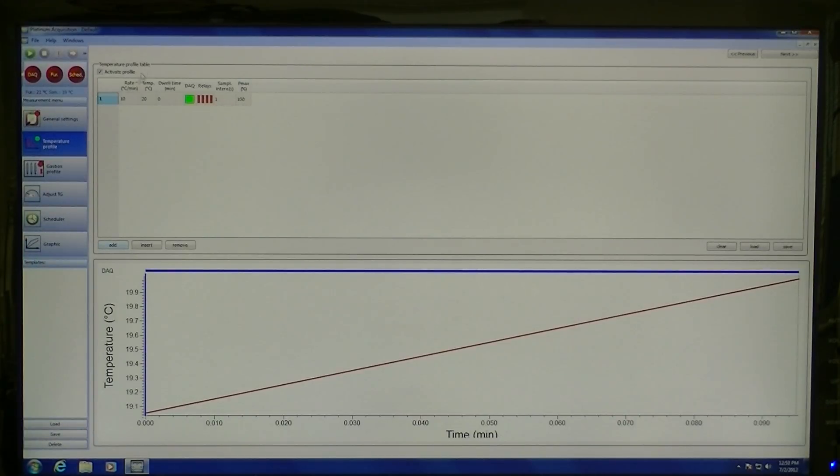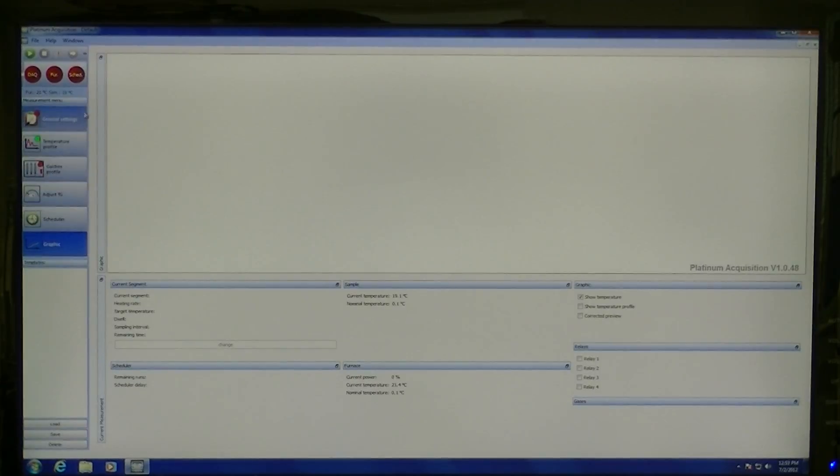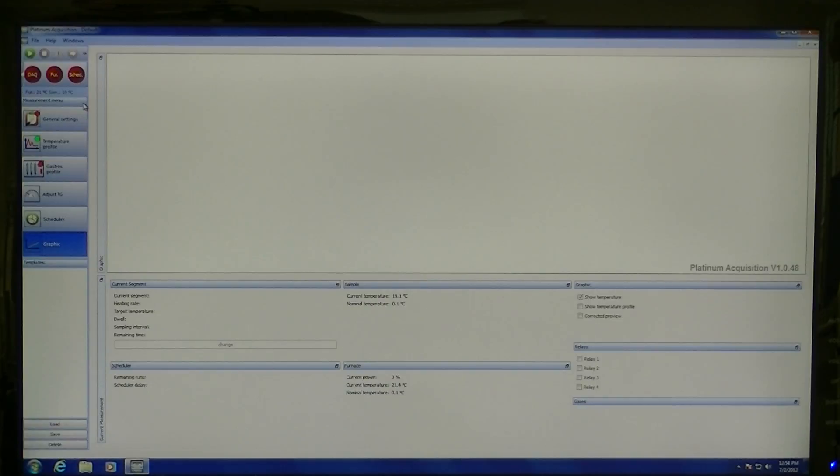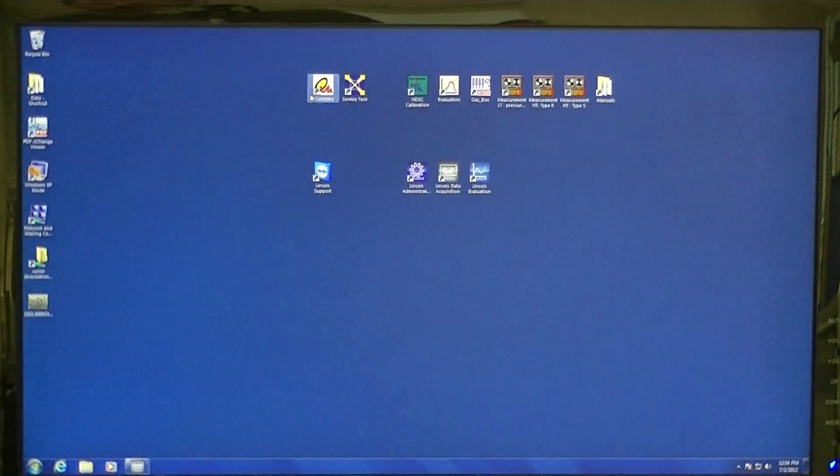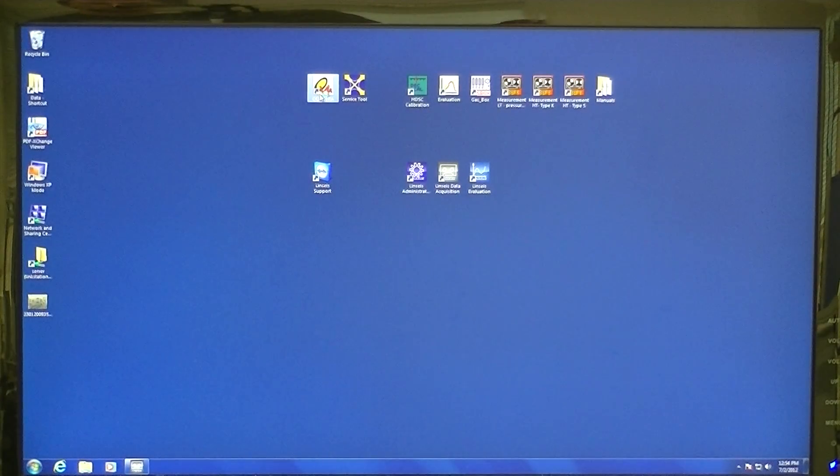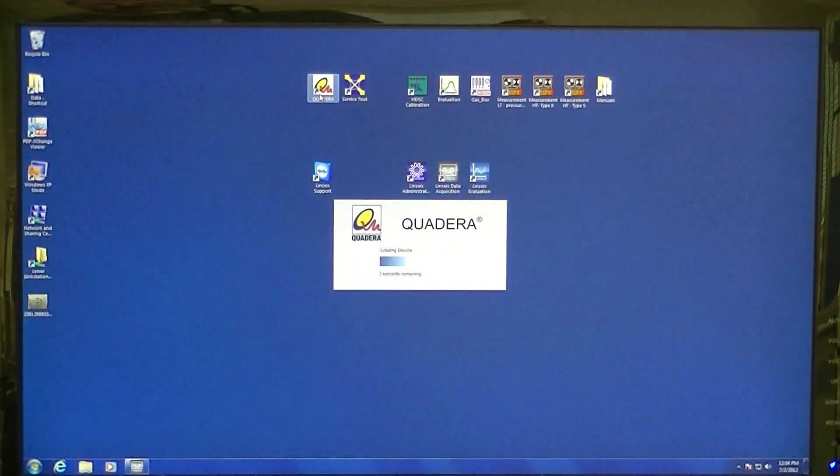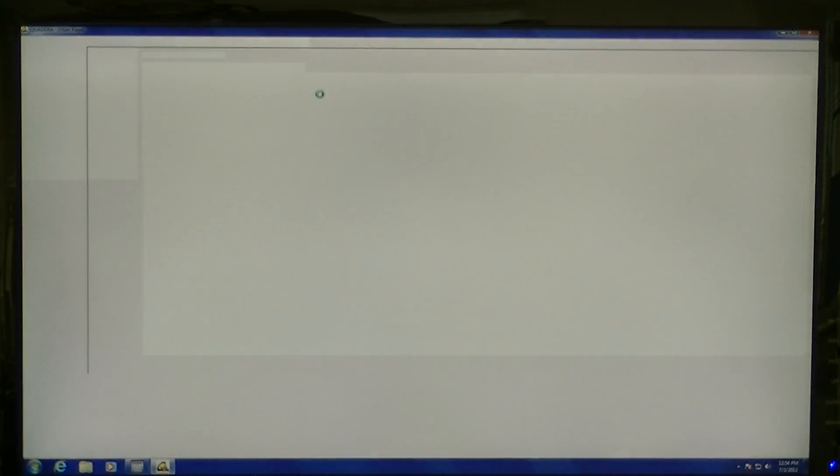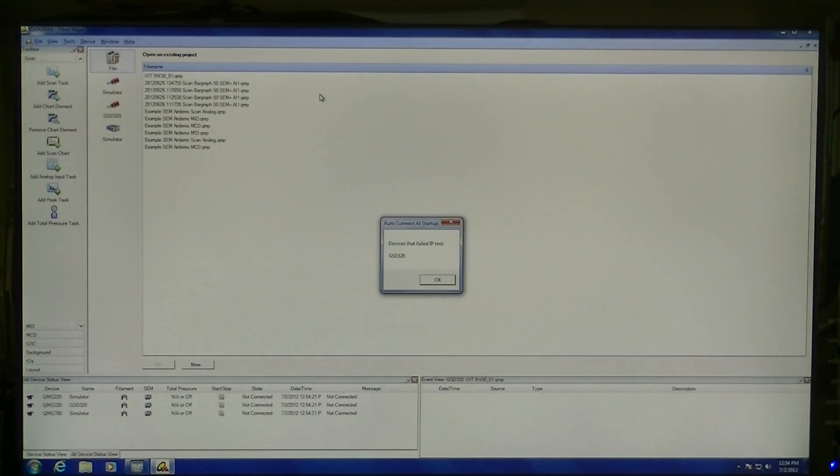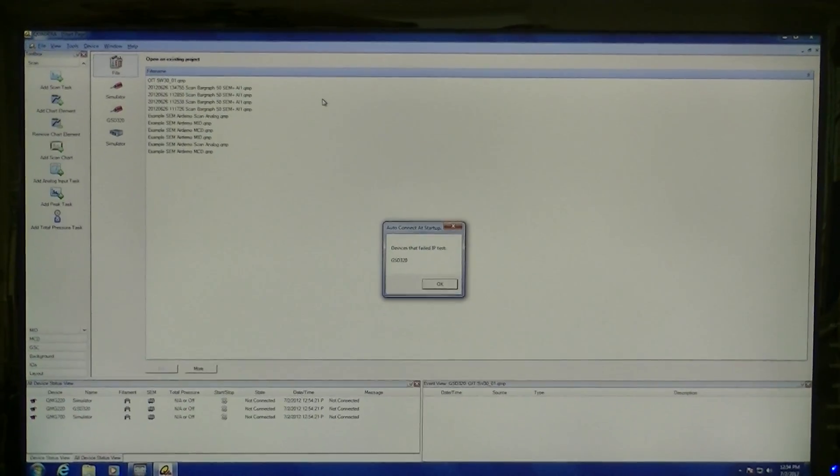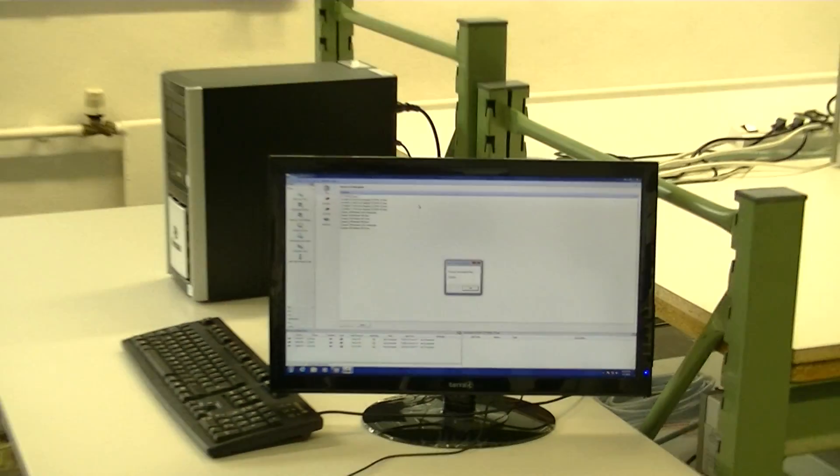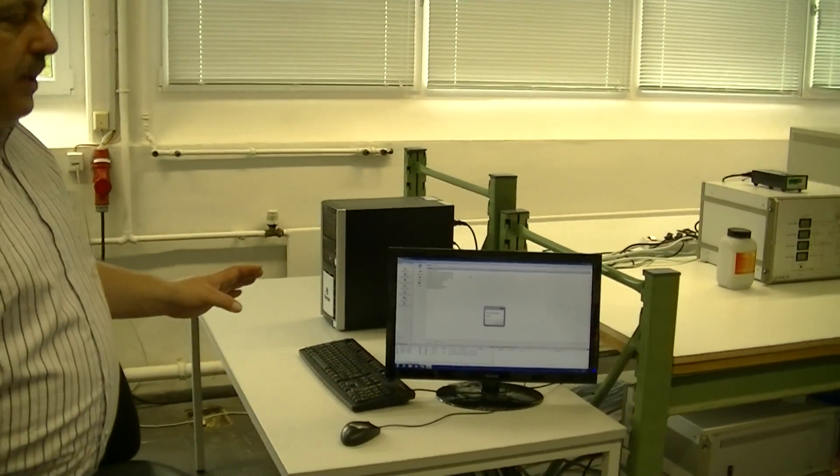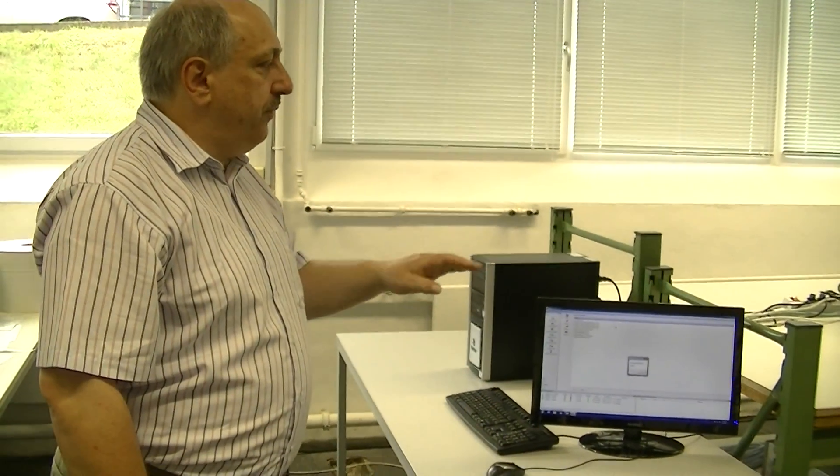When all this is done, you can really start the software and you can acquire the data for the TG and the DTA DSC signal. If you want to run the mass spectrometer also, you have to run the mass spectrometer software Quadera. And in this software you can adjust what kind of masses or what masses you want to see. The mass spectrometer is able to see data from 0 to 300 AMU. And you can adjust any window or only the individual masses you are interested in. When you start the experiment, the TG measurement and the MS measurement will be started simultaneously. And both will acquire data. The MS will also measure the time and the temperature from the machine.